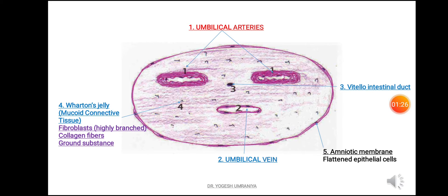Number 3 is the vitello-intestinal duct, which is the duct connecting the yolk sac with the midgut area. Number 4 is the mucoid connective tissue, also known as Wharton's jelly. This area is mainly occupied by highly branched fibroblast cells as well as collagen fibres and the ground substance. At the most outer periphery of the umbilical cord you will see the amniotic membrane, which is structurally made up of flattened epithelial cells.